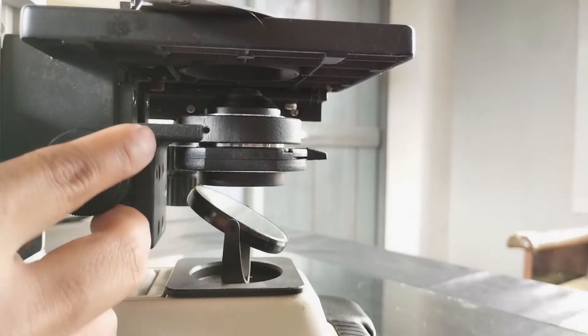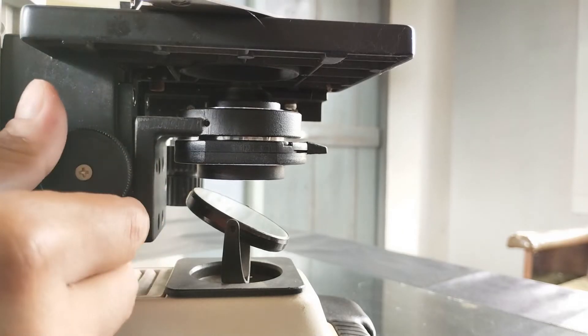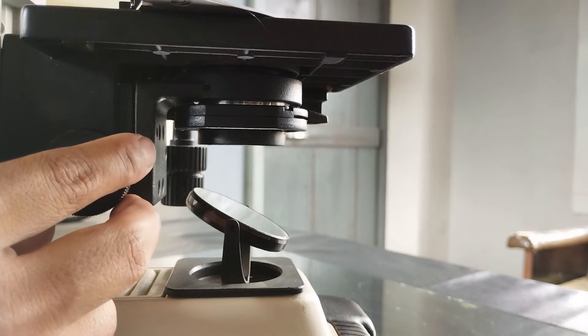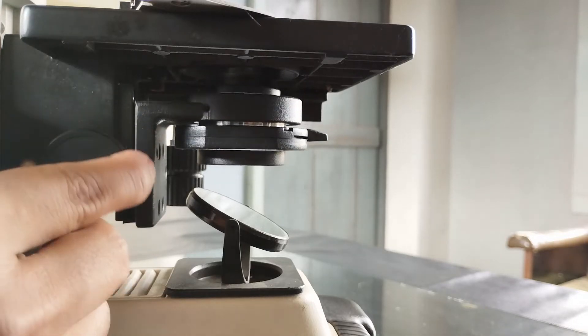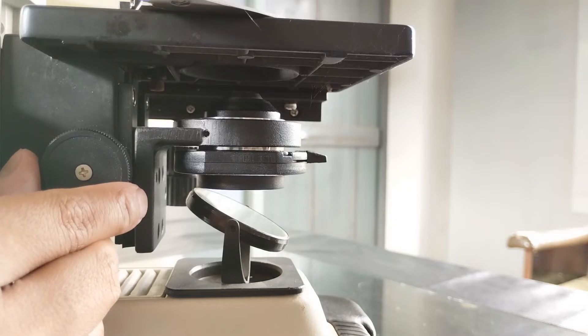The height of the condenser in some microscope models can also be adjusted. The closer the condenser is to the stage, the more critically focused the light is on the specimen, while the farther away the condenser is positioned from the stage, the more diffuse the light becomes and therefore the darker the image is.